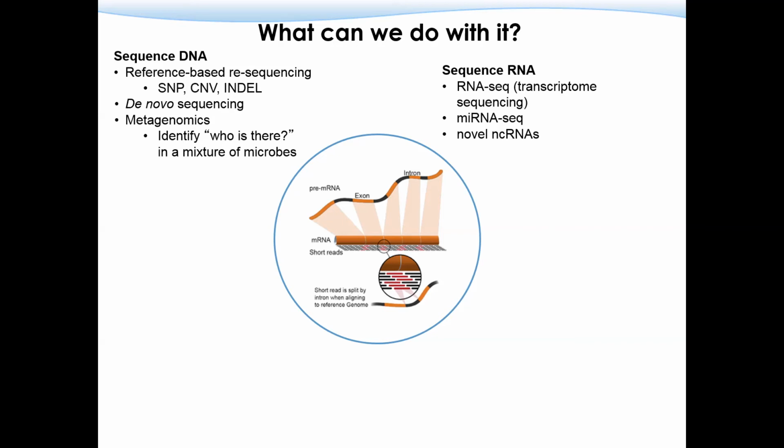The second type of application is to sequence the RNA molecules, because we can sequence so much and so fast. One of the major applications will be the RNA sequencing technology. We can use the same technology to do novel non-coding RNA identification as well as small RNA identification.